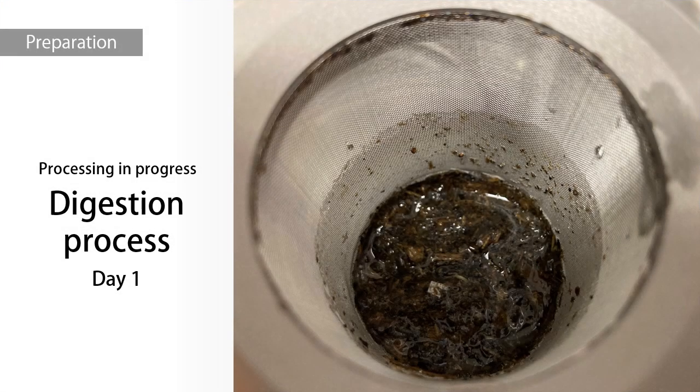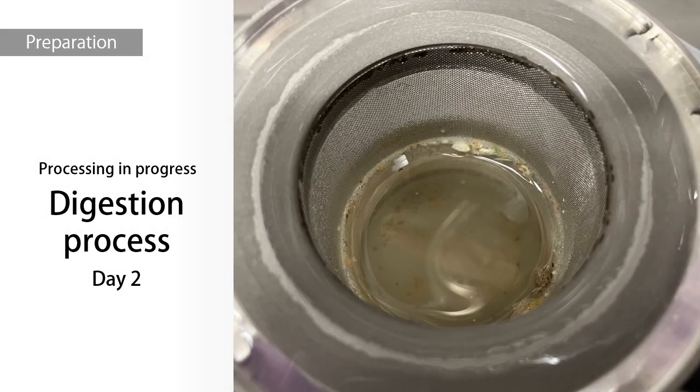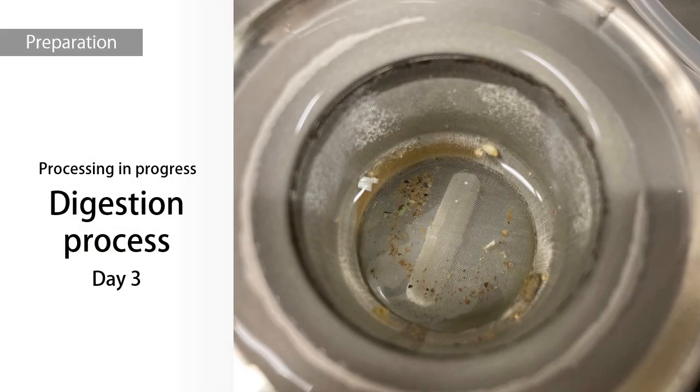This is what it looks like during the digestion process. As time passes, the sample becomes transparent, and you can see that the contaminants have been properly removed.